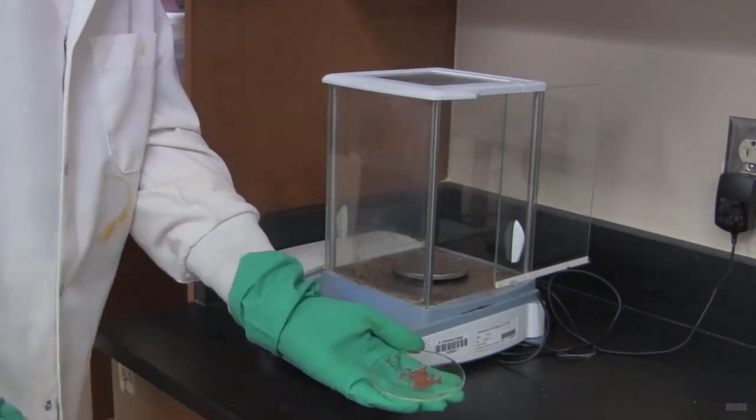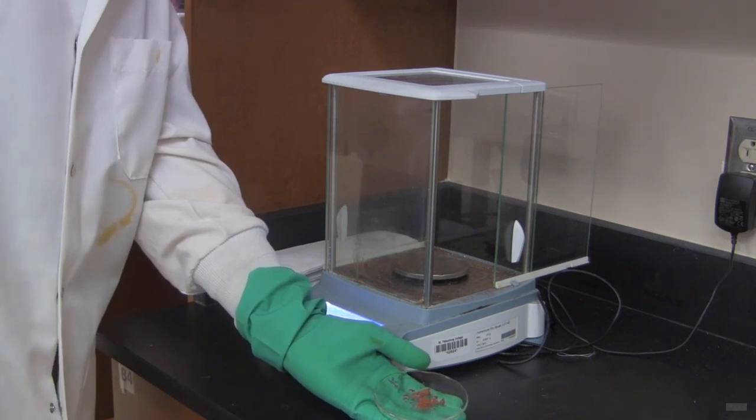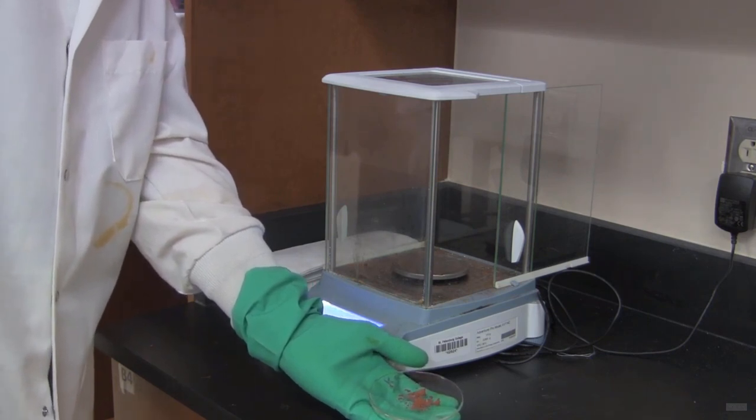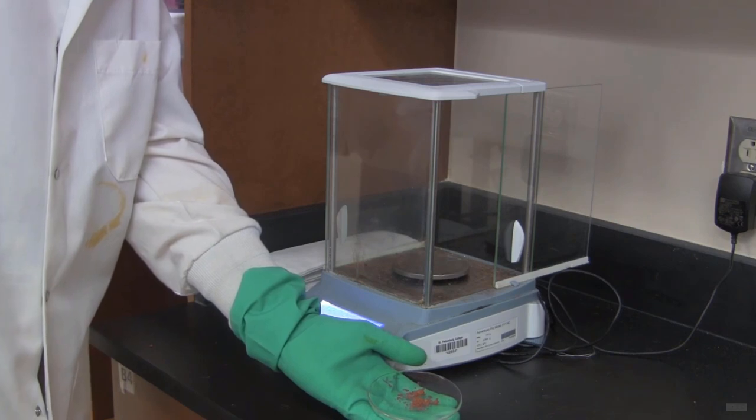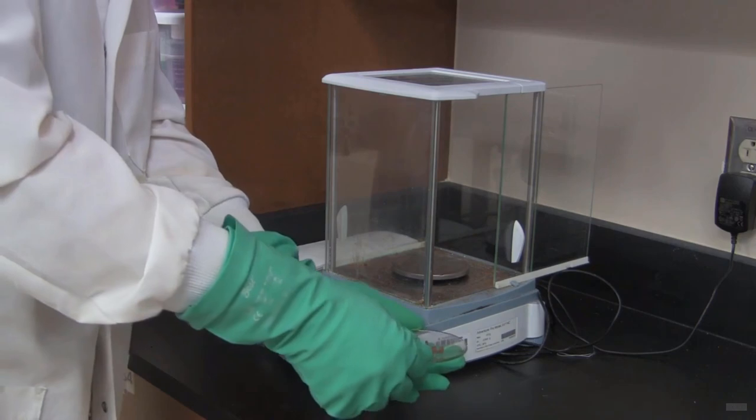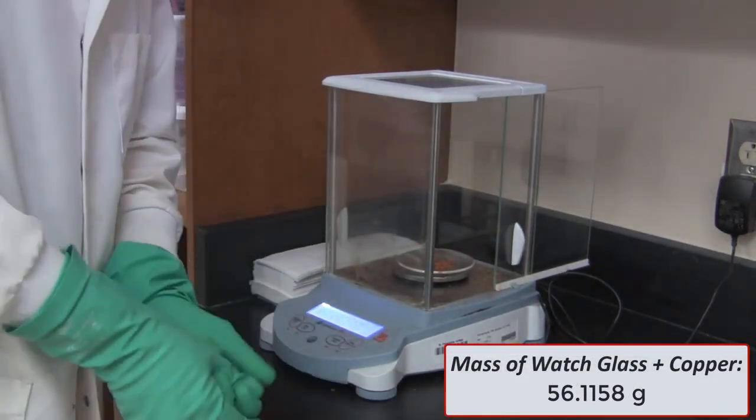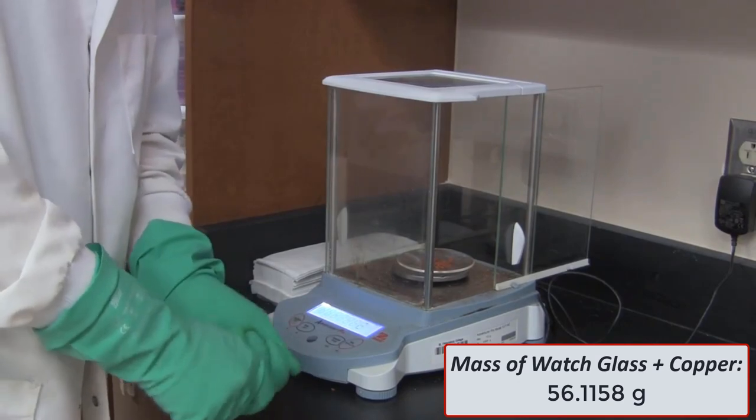So now we've got our copper. It's been dried. And I've taken it out of the oven. And I've let it cool for a few minutes. It's never a good idea to weigh anything while it's hot. So it's been taken out of the oven. It's been cooled for a bit. And now what I'm going to do is weigh it on the balance. And that's going to allow us to come up with our mass of copper.